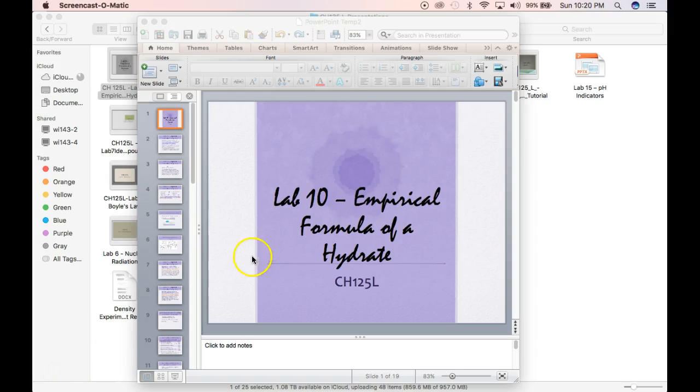So in this video, we're going to be discussing Lab 10, the empirical formula of a hydrate. We had looked at what a hydrate was in the previous lab, Lab 9, and we talked about how the hydrate is a compound that has water molecules loosely attached inside its crystal structure.